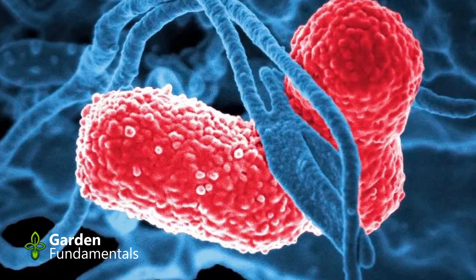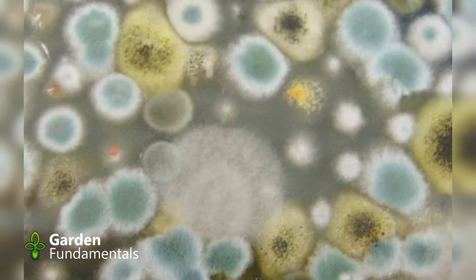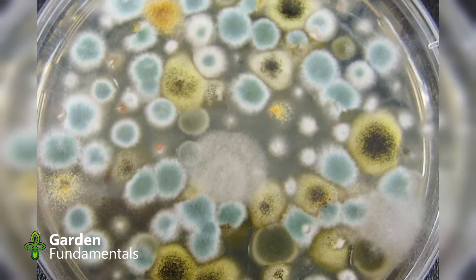Let's first talk about accuracy — how accurate are the numbers from this test? There are lab tests for measuring microbial biomass in soil, but here we have a real problem. All of these tests are indirect measurements; they're not really measuring the mass of microbes directly. Each test has limitations and works on certain soils but not others. The bottom line is we really don't know how many microbes are in the soil unless we do microscopy work.